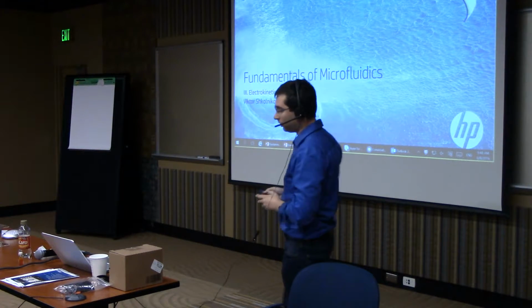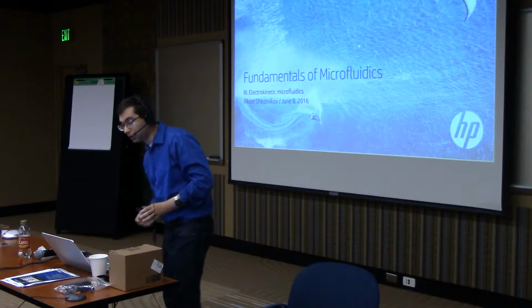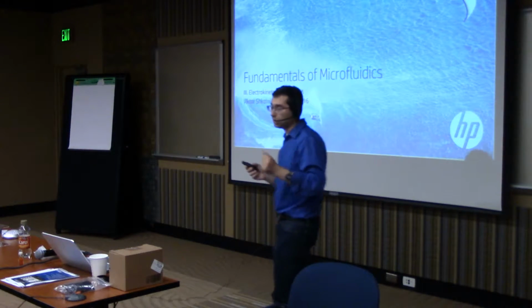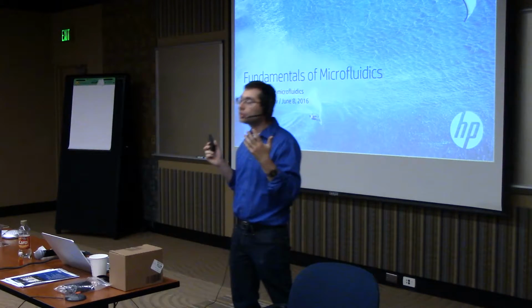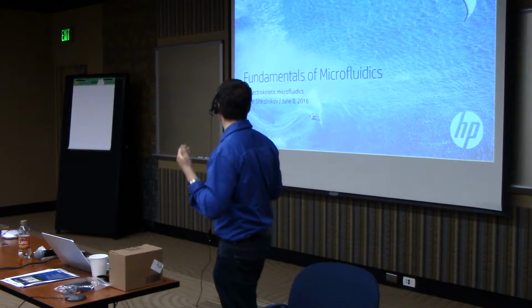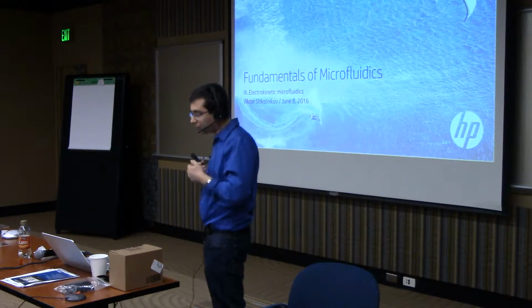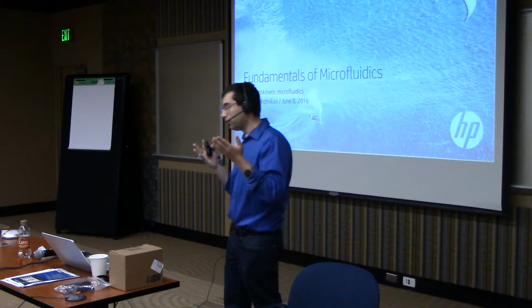So for the third part of this talk, the last part of this talk, I'll concentrate on electrokinetically driven microfluidics. I'm a little biased towards electrically driven microfluidics because that's the field I'm most familiar with. My graduate work was in this field. So that's one of the reasons why I'm presenting this.